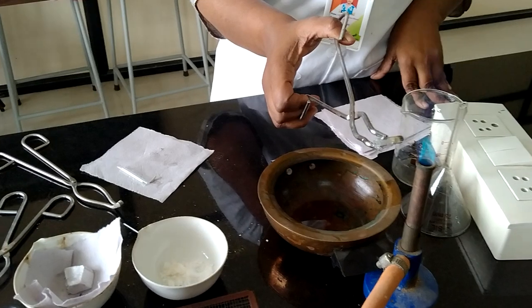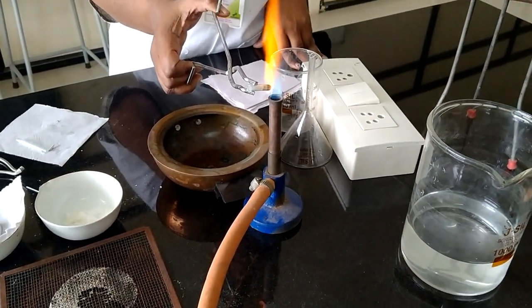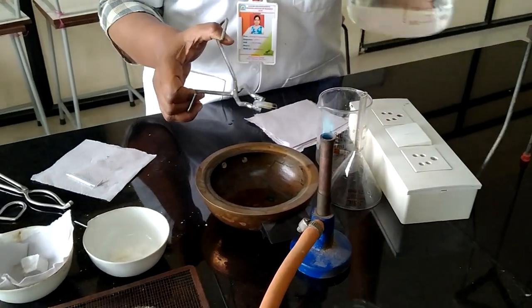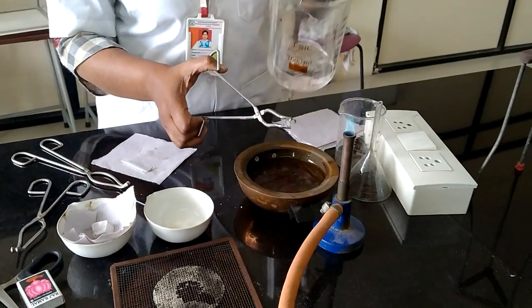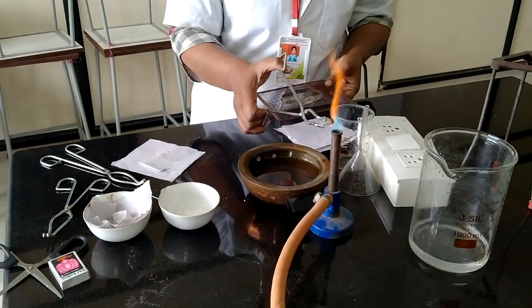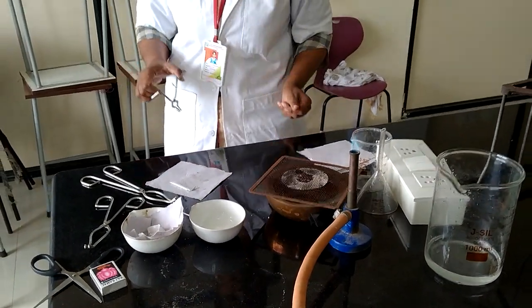Again reheat the fusion tube until the flame becomes red hot. Then take water and break the fusion tube in the water like this.